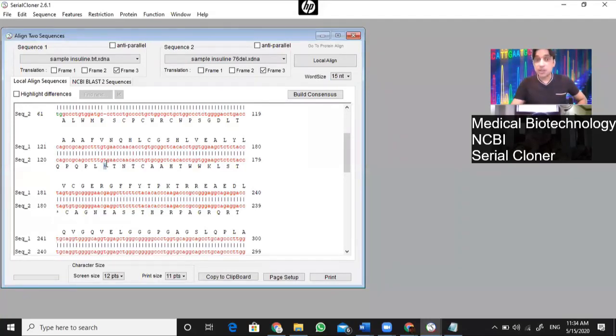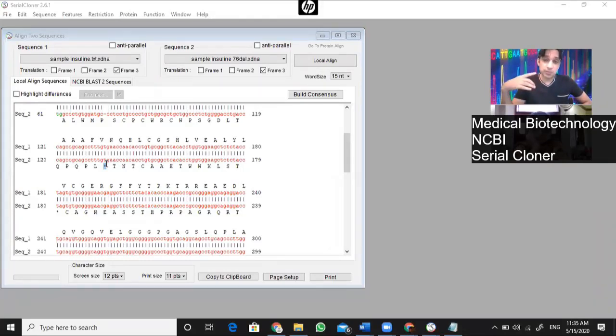Okay, so that is how you can play with that software in a different way. And you should try all these different things, and you should enjoy and try to exercise and practice. There is no shortcut. मैंने बहुत कोशिश की है क्योंकि मैं खुद को दुनिया का सबसे ज़्यादा lazy इंसान समझता हूँ. I wanted to do things with the least possible efforts.